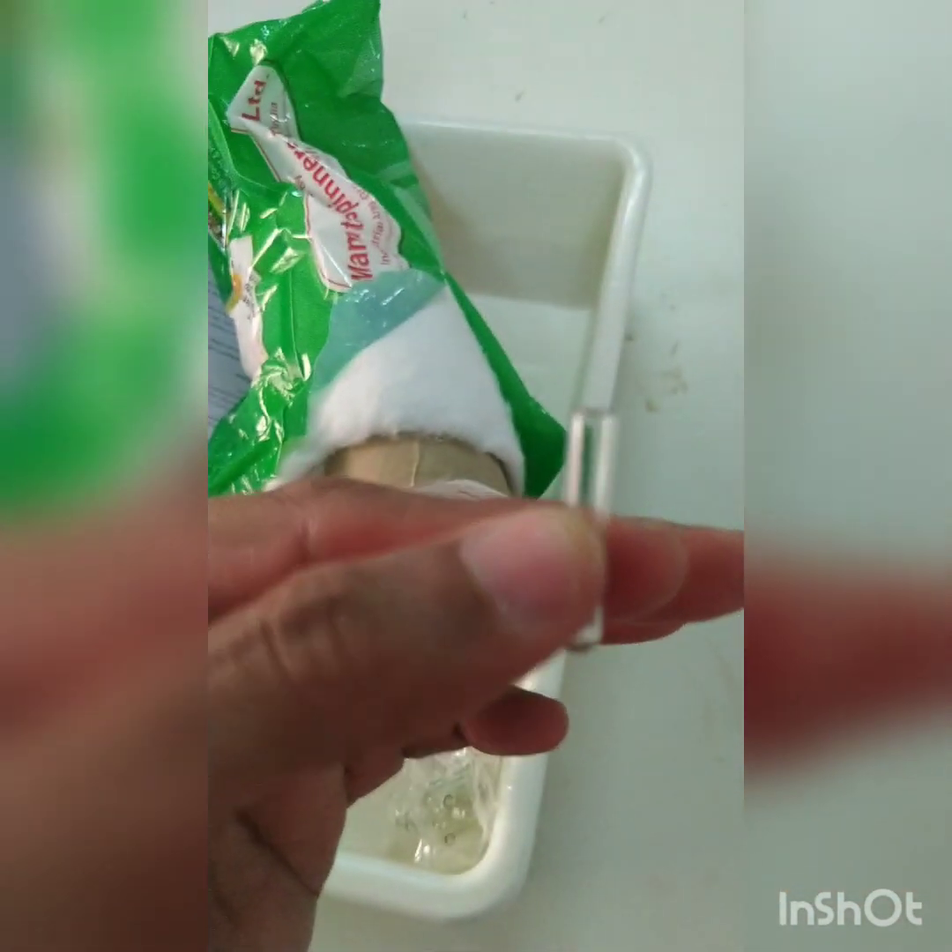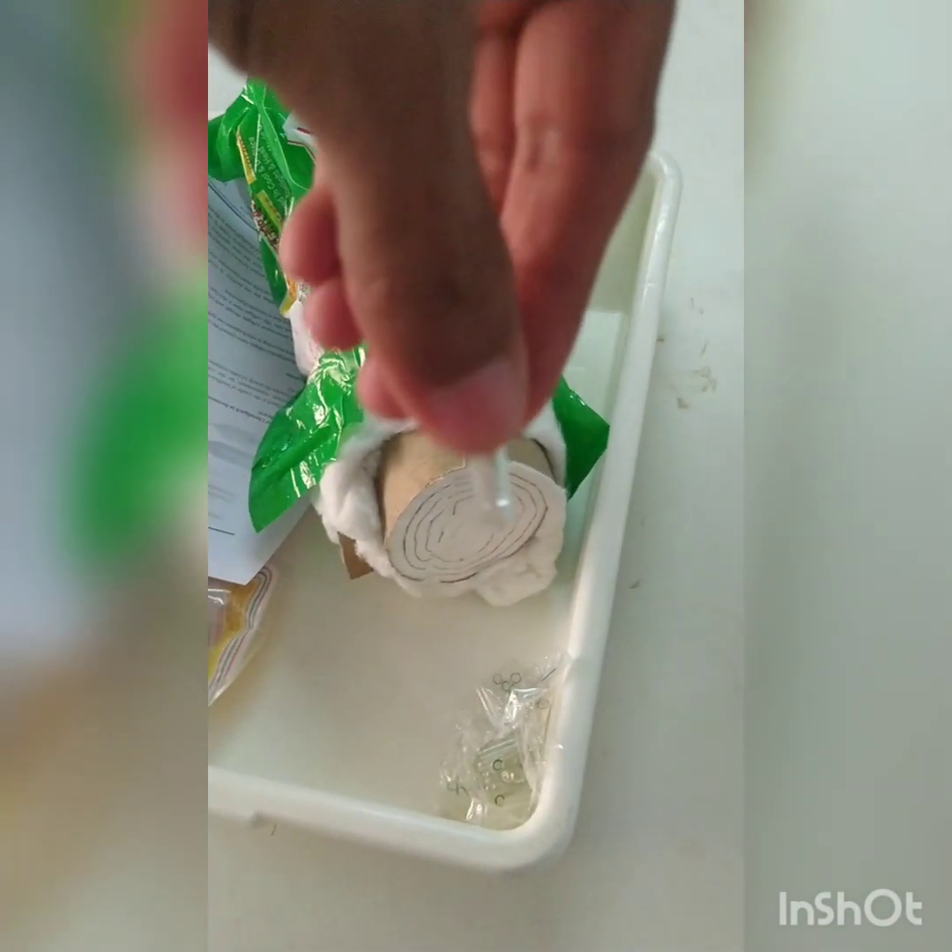For that we are going to use different glassware and chemicals. First and foremost, we require medicated cotton, then we require special types of tubes called Durham tubes. These tubes, as you can see, are about 2.5 mm in diameter and about 2.5 to 3 centimeters in height. Such small tubes are inserted in inverted fashion in the larger tubes. Then this is the McConkey broth.